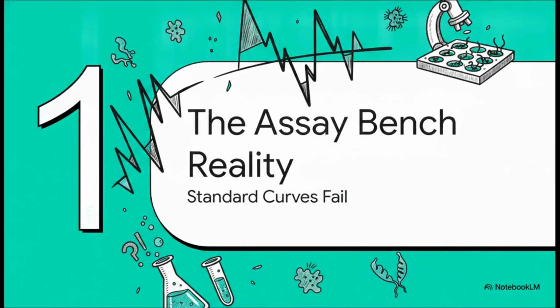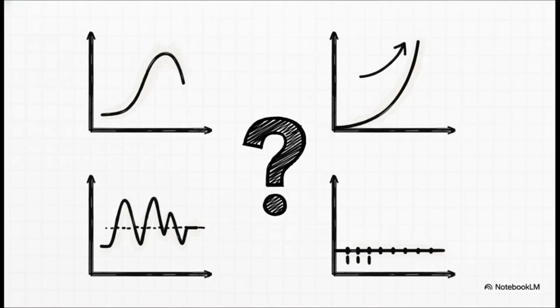Or really, when standard curves fail. Let's talk scientist to scientist here for a second. Immunoassays rarely behave like those perfect textbook examples we see in the kit manuals, right? We're dealing with the messy, unpredictable reality of biology. The textbook, perfectly bell-shaped hook effect is actually pretty rare to catch perfectly on a plate. Instead, what you usually encounter are these incredibly ambiguous failure patterns.